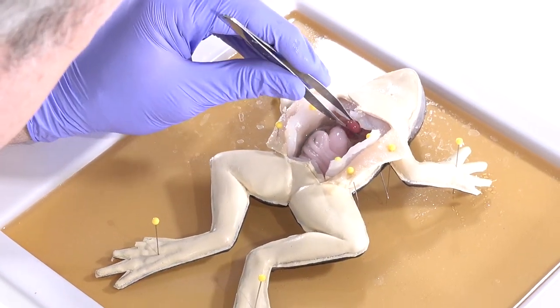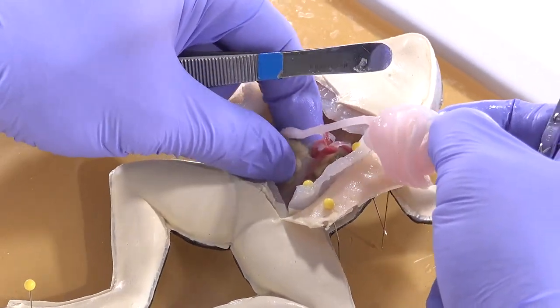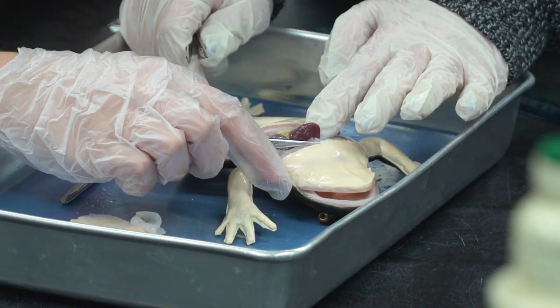With the synthetic product, you don't have that. What's really great about these syn frogs is that they're stored in water and alcohol, so they're completely safe to touch. We want the students to feel the texture and realize that this is what a real frog feels like. There was not a student in that classroom that was afraid to participate. A lot of kids don't want to be part of dissection, so they'll opt out — but we have had zero children opt out today.